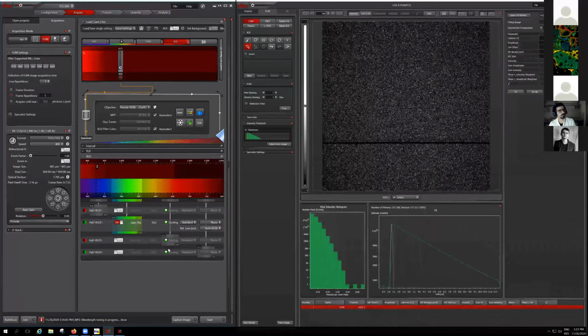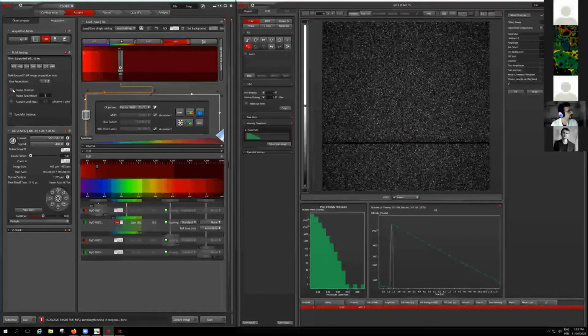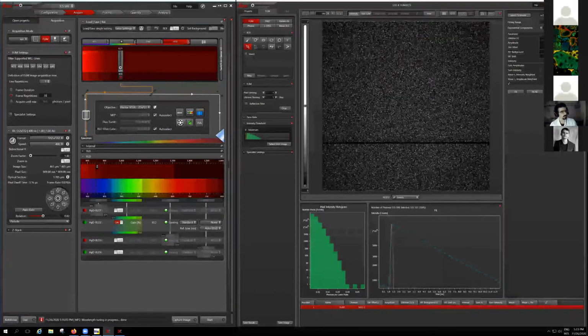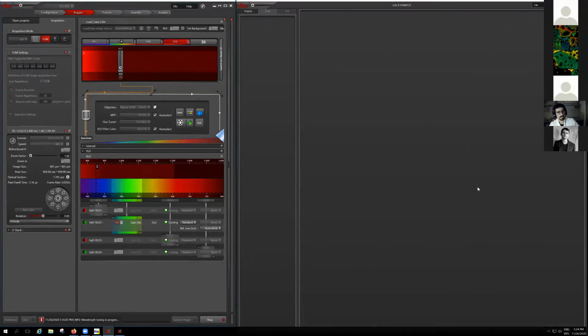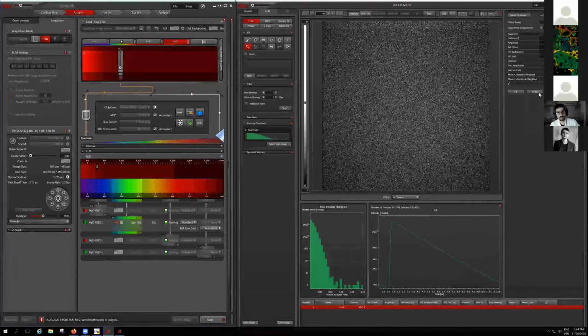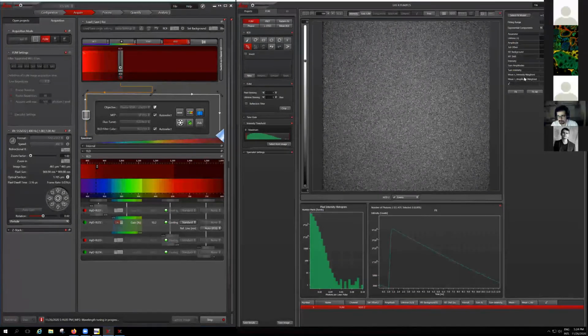Okay, anyhow, now I would like to do some actual FLIM measurements, and I would go for something like a frame duration of a minute, or I can use a frame repetition of 20. That 20 comes from the fact that we are doing our metabolic FLIM imaging with 20 repetitions. So I'm just going to start this acquisition. The next step is playing around with the fitting parameters of the software, talking about some of the parameters, what is important, what we have, and how we can assess the analysis later on. This is a part of knowing the sample, knowing the system.